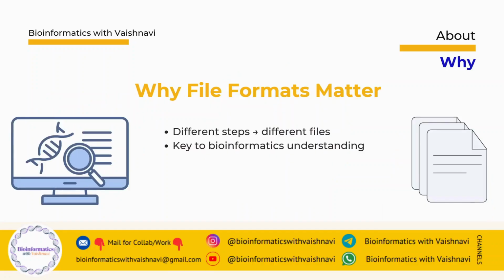So let's begin. One of the most important things you should know is that the NGS machine doesn't give results like "this is the mutated gene." It gives data in a certain file format. This data moves through different steps, and at each step, a different file format is present. Once you understand these formats, bioinformatics suddenly starts making sense.